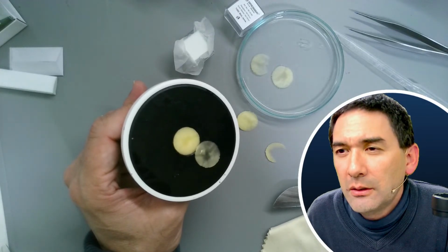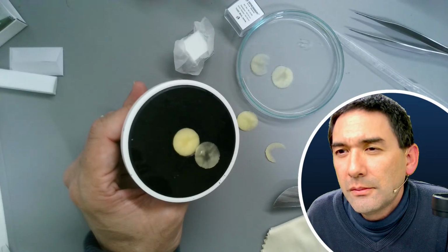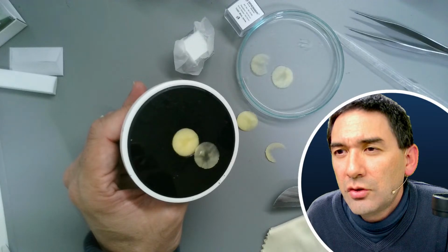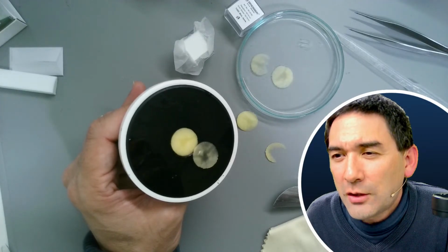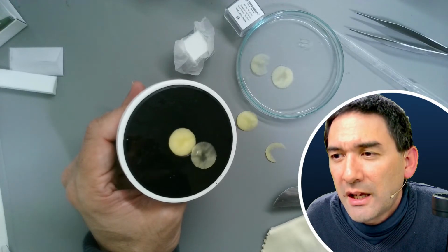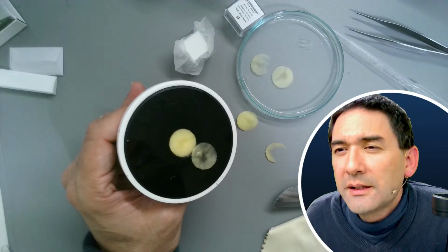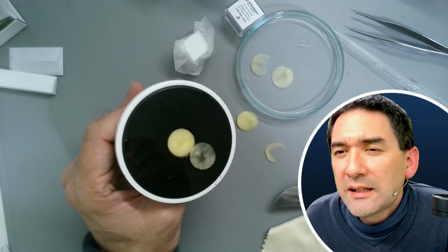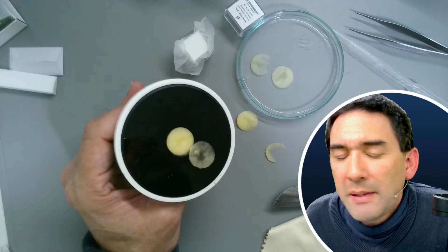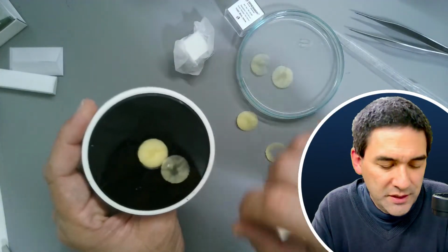Let me have a look. There is some question. Let me just quickly, vegetable soup. There's actually quite an elegant solution using the ring to fit the specimen to size. Yeah, that's the thing here. Someone suggested the side holes are to pin the specimen down. The question is which ones?